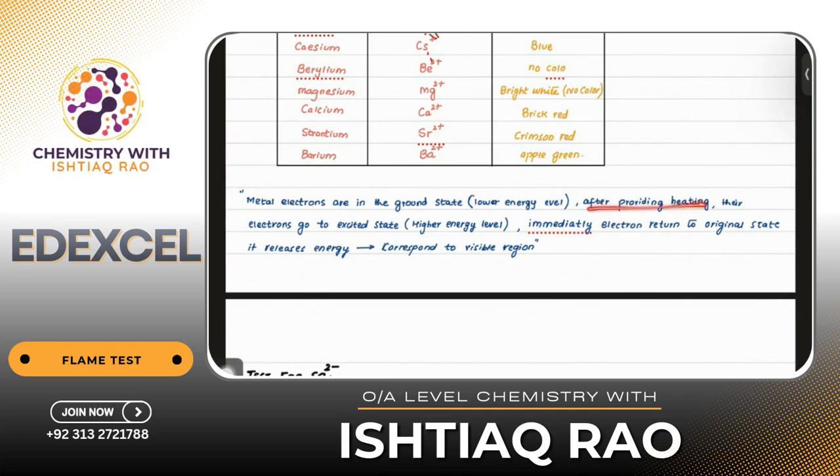After providing heat, when you take a sample under the flame, the electrons go to the excited state, a higher energy state.